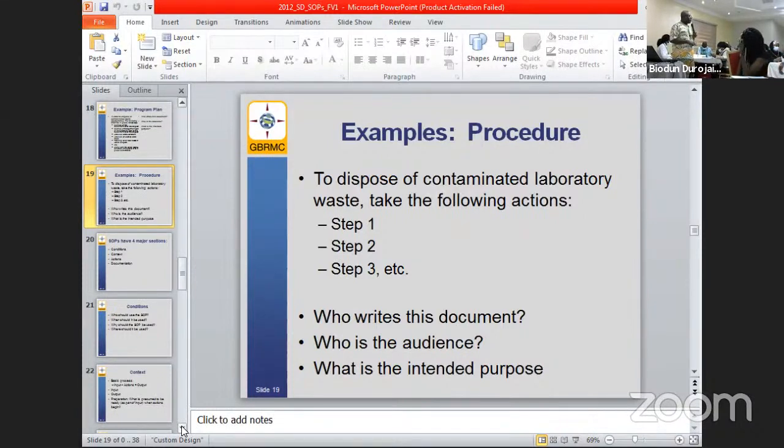Well, if it is the laboratory we're referring to, the duty of SOP generation is in the purview of the laboratory manager. If it's a safety issue, the safety officer, in conjunction with the laboratory manager. And when all those documents have been written, if there is a pathologist in that laboratory, it now becomes the duty of the pathologist to read through it and be sure it's fine, and then it's signed off for use.